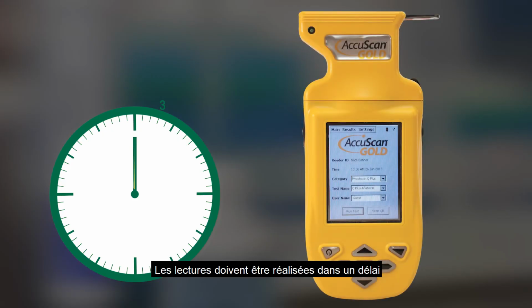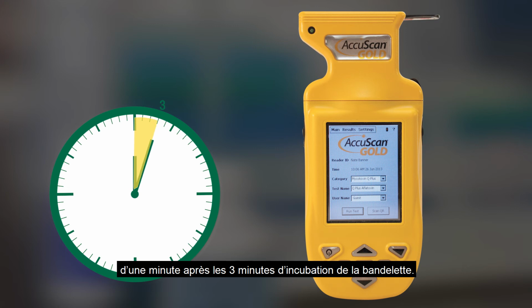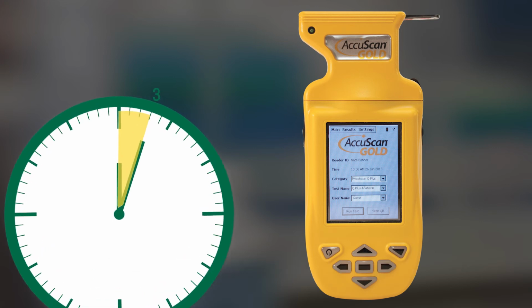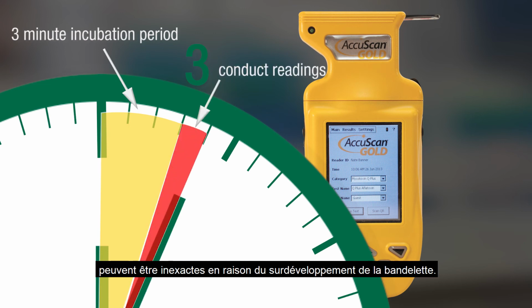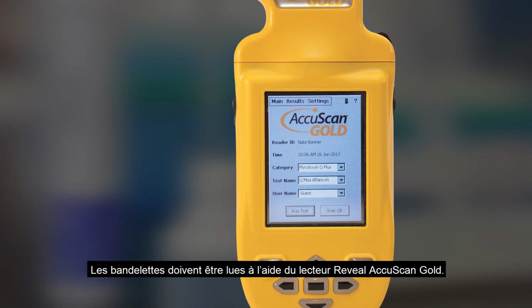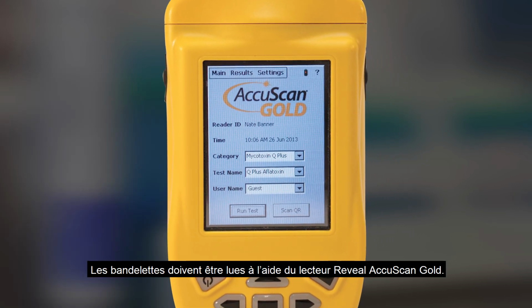It's important to note that readings must be conducted within 1 minute of the completion of the 3-minute incubation. Readings conducted after 4 minutes may be inaccurate due to overdevelopment of the device. Strips must be read using the Reveal AccuScan GOLD reader.